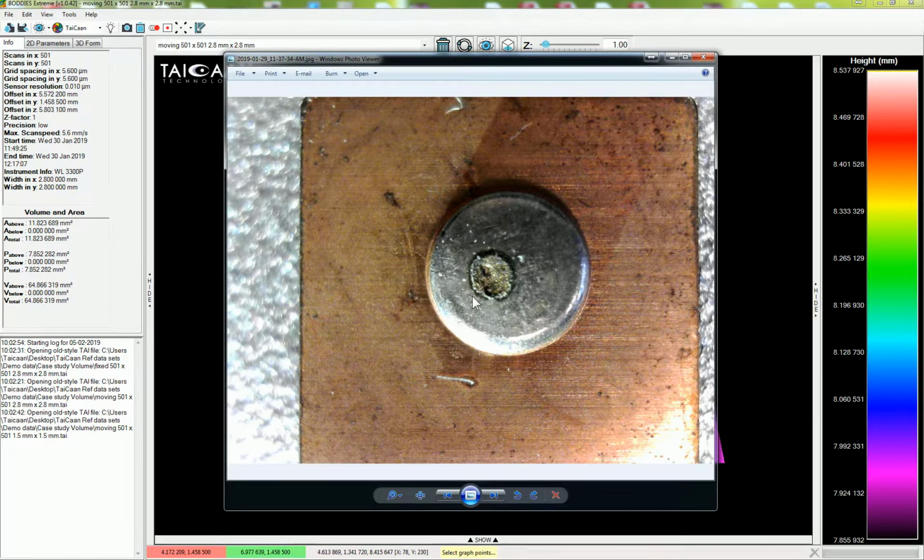This particular switching device is silver nickel. It had undergone 3,000 switching operations with a DC current of 10 amps with a 14 volt power supply. And what you see is the consequences of that activity. What we'd like to know is the amount of wear that's taken place, so we need to know the volume of material that's either been added or lost from this surface.